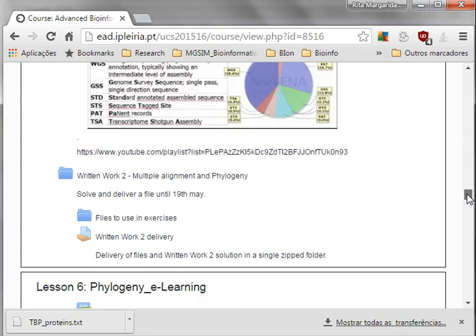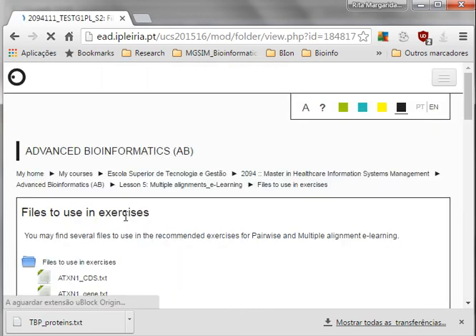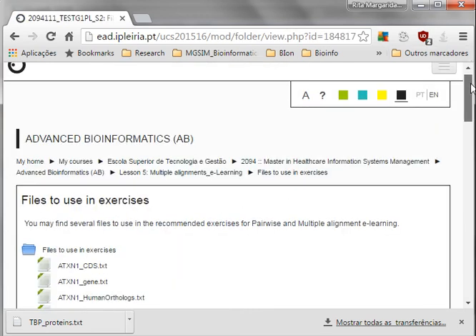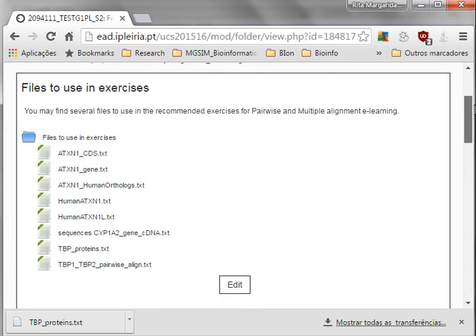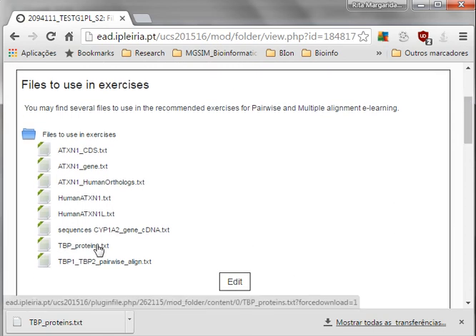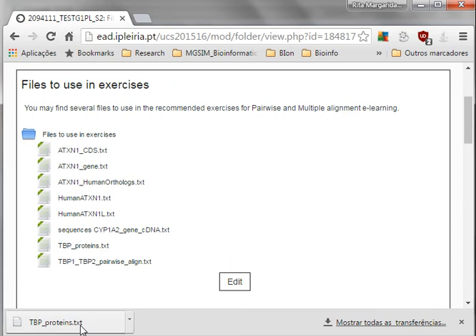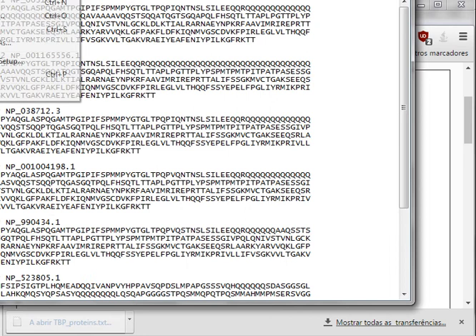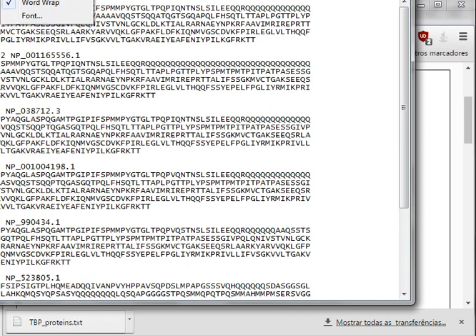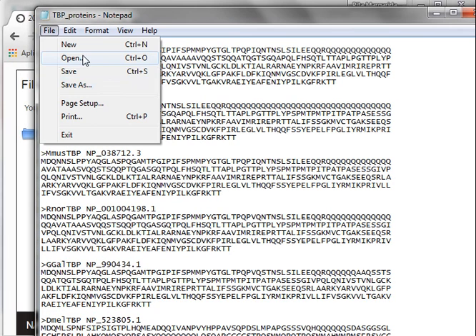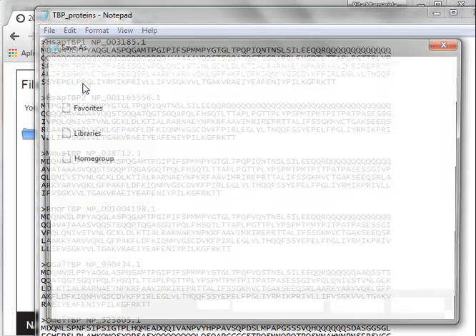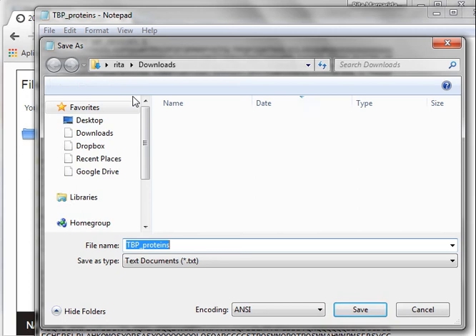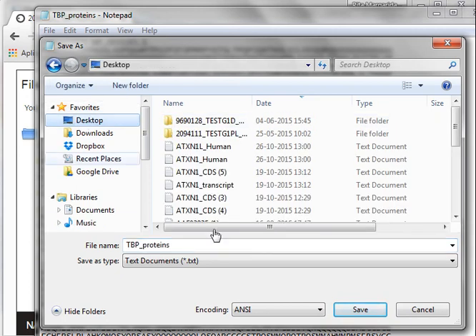In the beginning, you have to go and pick up the files to use. So you get into the files and then if you want to perform the multiple alignment, you will perform a multiple align with protein sequences that are all together. You can save it in a place you know, so you can just place it on the desktop so you can access it easily.